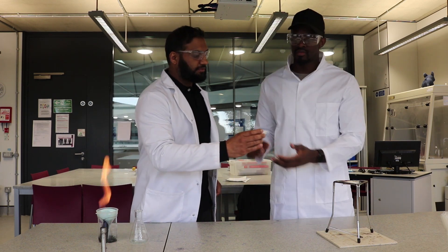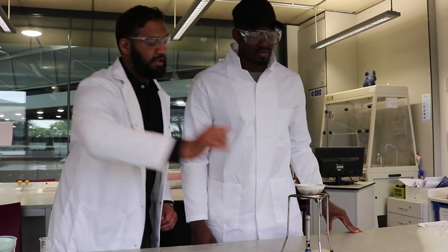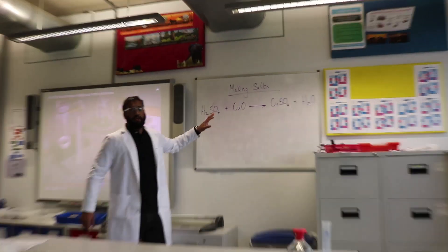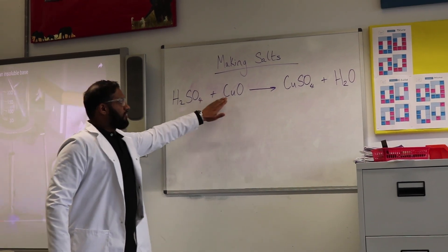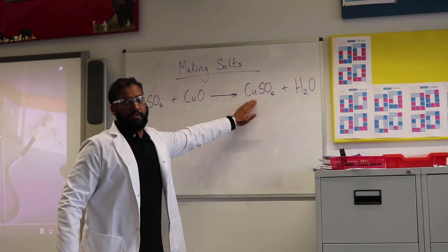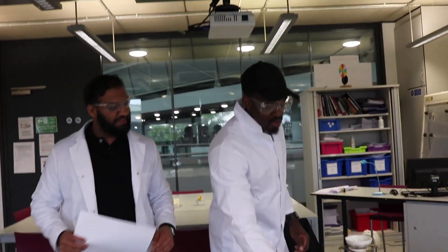We're heating with a blue flame and stirring. The simple equation for what we're doing: sulfuric acid plus copper oxide gives copper sulfate plus water. We're evaporating the water to leave copper sulfate crystals. It's starting to spit, so remove the flame and move it away.